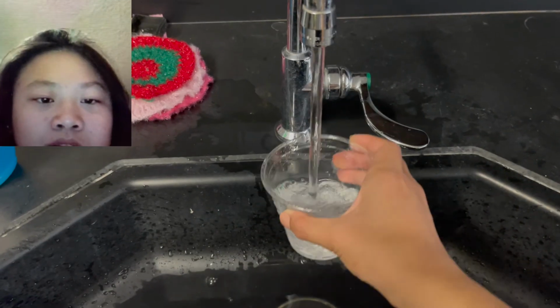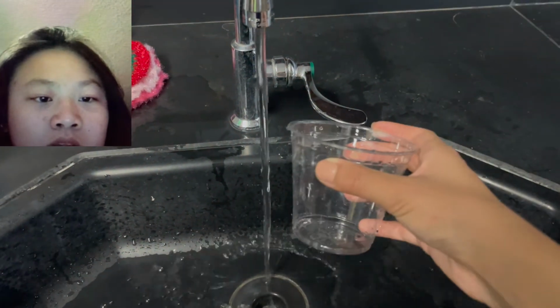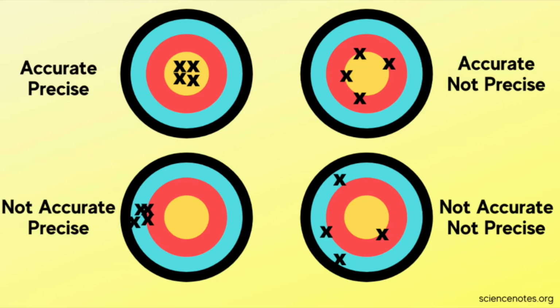Moreover, here's Feng Lin with another human error. The second error that occurred during the experiment shows that additional water droplet clinging to the sidewall of the cup would contradict with testing of the independent variable. Having additional water droplet in the cups would decrease the accuracy and precision of the experiment.